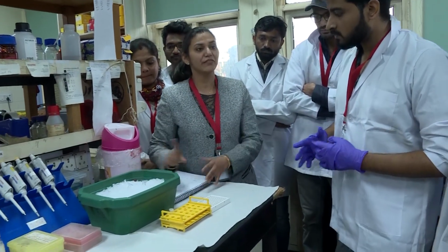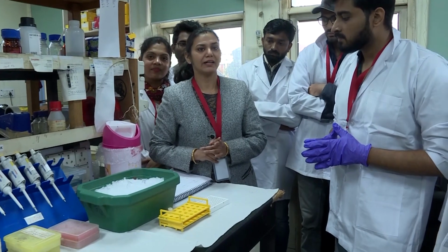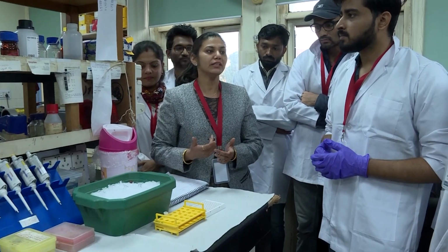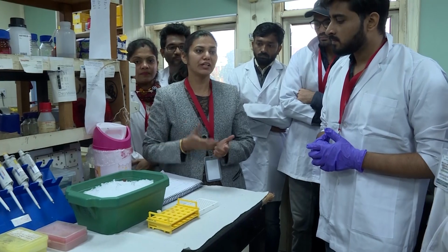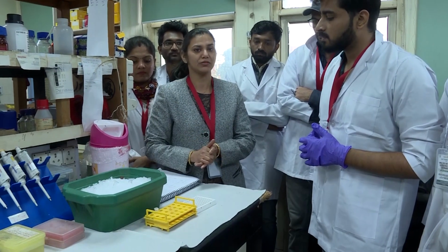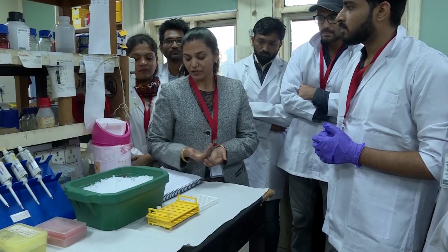So here we have taken one gene and one endogenous control. The gene is our MAP kinase, and the endogenous gene which we are using here is beta-actin, and we are going to do it in a wheat sample. The treatment is heat stress. We are giving heat stress to the plants at the vegetative stage and at different stages. We are isolating the RNA from leaf tissue.